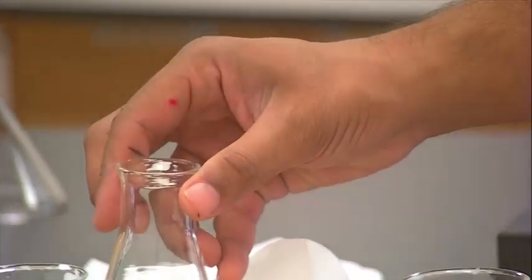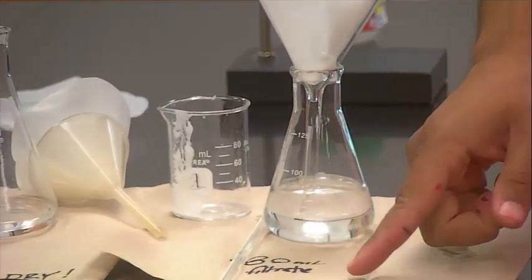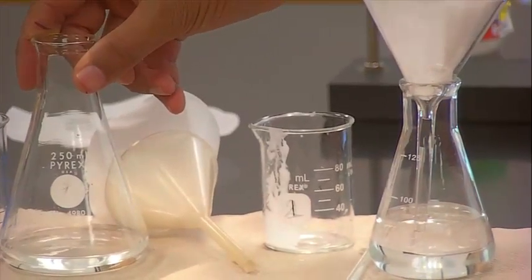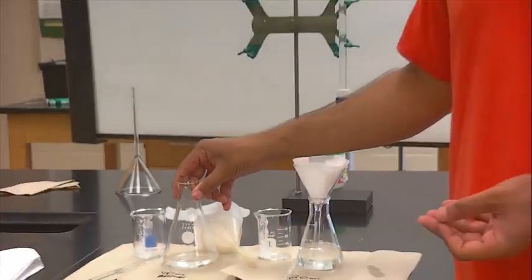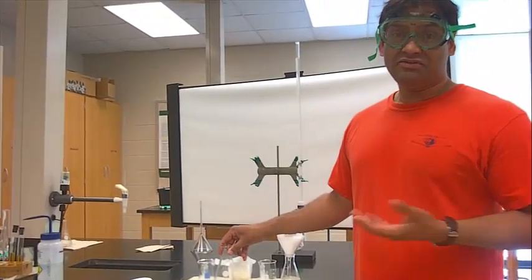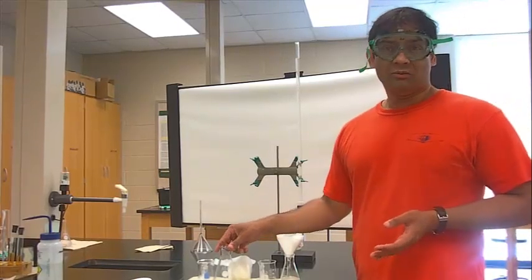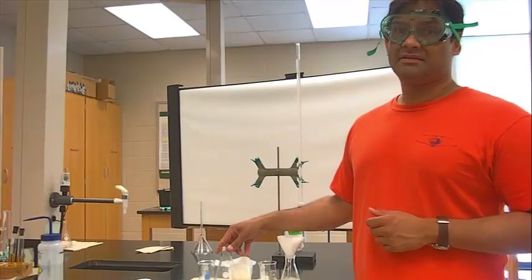Both, whether you put that precipitate in 40 mils or whether you put that precipitate in 80 mils. So it's this filtrate that contains the calcium ion and the iodate ion. You will react the iodate ion with potassium iodide in acid solution and titrate that with the thiosulfate that you've standardized in the first part of this experiment. So it's important to realize the addition of water will actually mess up the solubility and change the equilibrium dynamics.